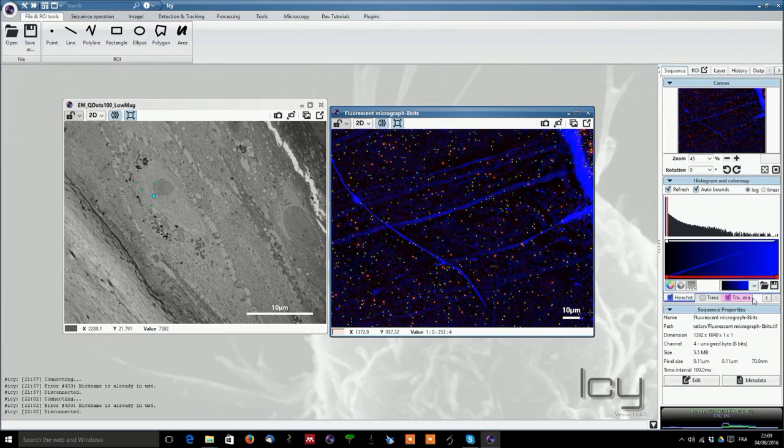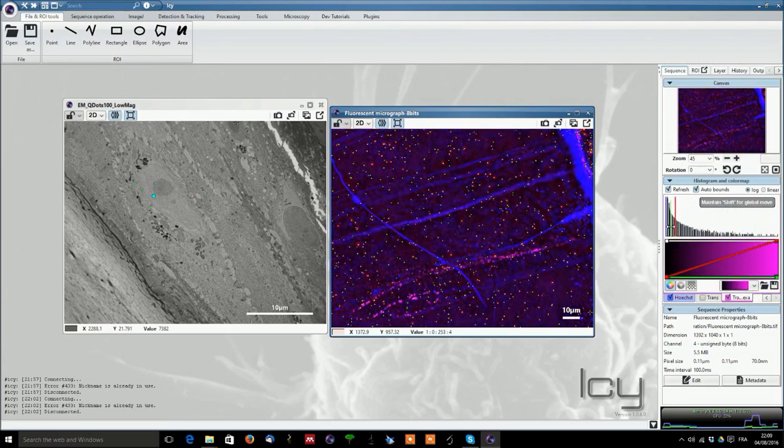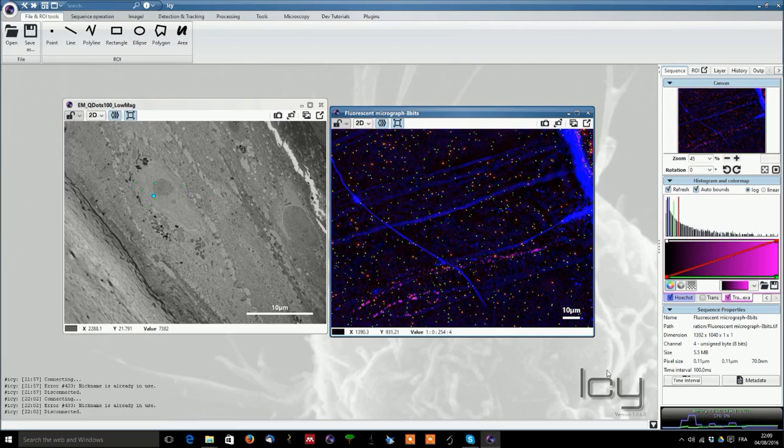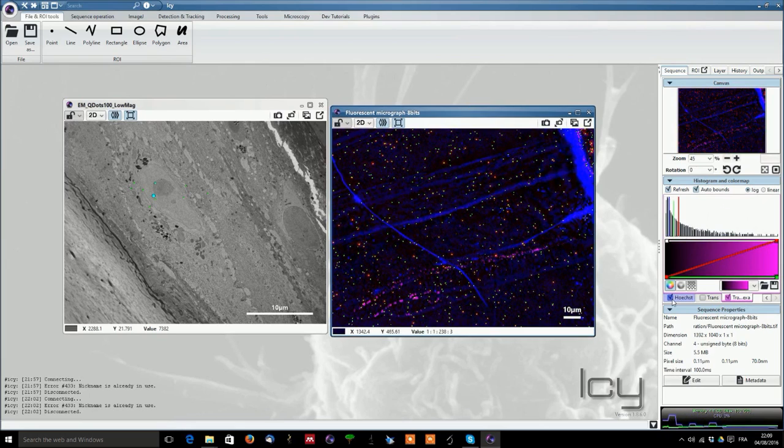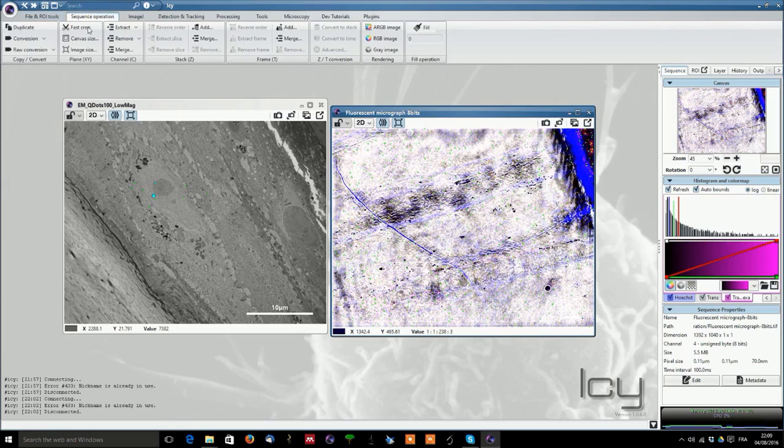The Hoechst can also be adjusted so that you will see only the structures of interest and also transferrin Alexa where the signal of interest will appear at the bottom layer of our picture. So this is the whole system.